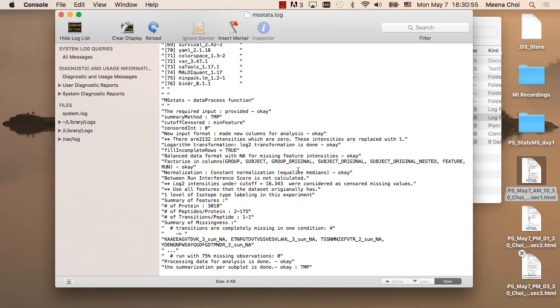So first, this is very important for your record. Second, if you have an error, this is kind of a tracking document. So if somewhere it stops, we can easily find where the issue is, and so on. So for these 2 points, this is quite important.